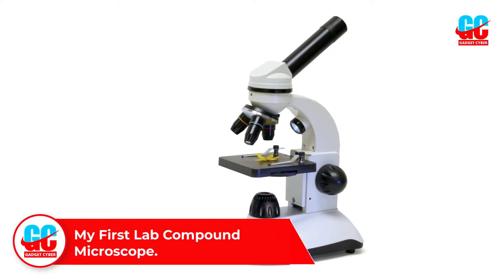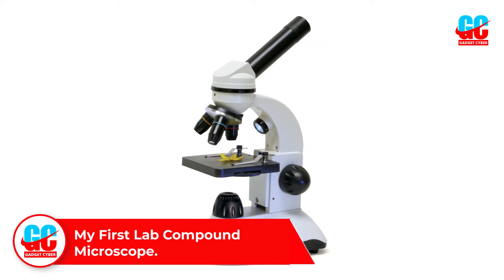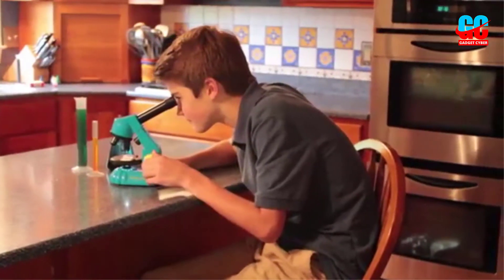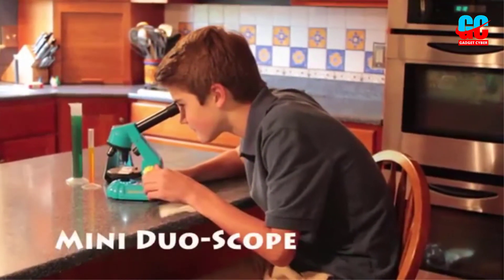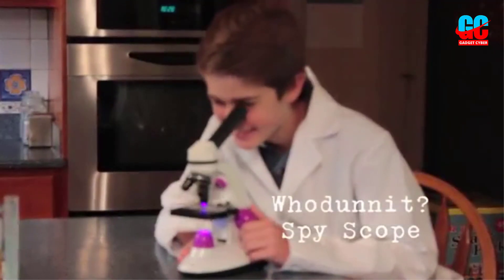Number 4: The My First Lab Duoscope microscope is a high-quality yet affordable device that we think is the best compound microscope for the money. It includes an accessory kit with useful items such as slides, plastic dropper, lens paper, forceps, petri dish, and more. This makes it a great option for beginners and children.